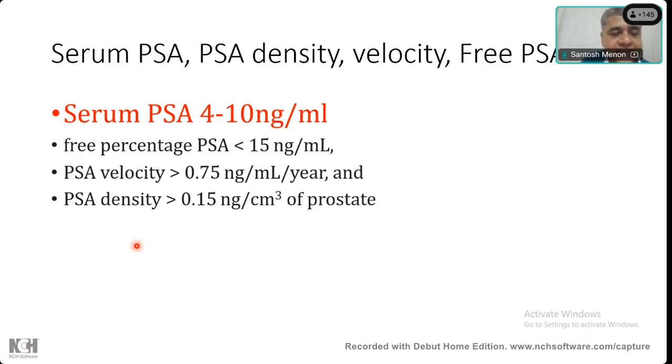have initially not decided to do a biopsy, but when they follow up the patient over a span of time, they look at the change in the PSA level as per the time, and then they would use it to sort of biopsy the patient.